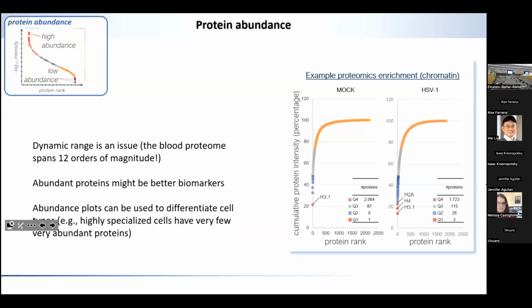And even when we work with single cell proteomics, that I'm sure you've heard of, yeah, we can look at proteins from very, very tiny amounts of material. The problem, again, is not the sensitivity of the instrument, it's the dynamic range of the instrument. The very abundant signals suppress the ones that are very low abundant. So keep that in mind. But in a way, it's also a very interesting perspective to look at.